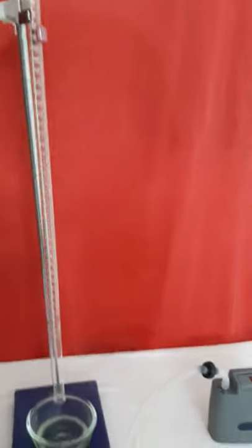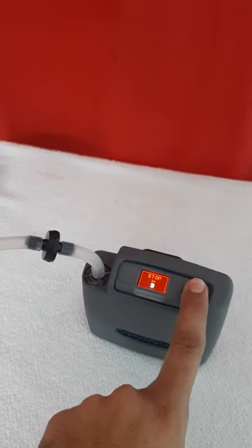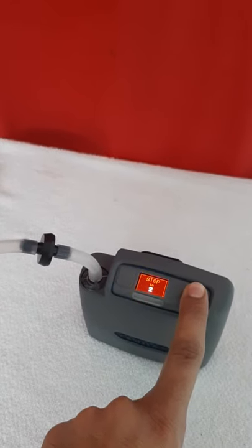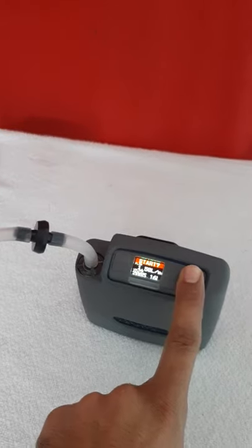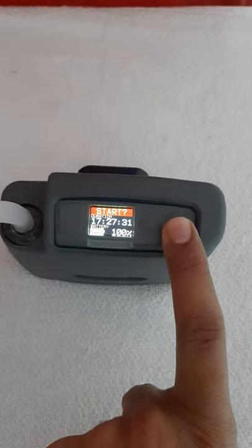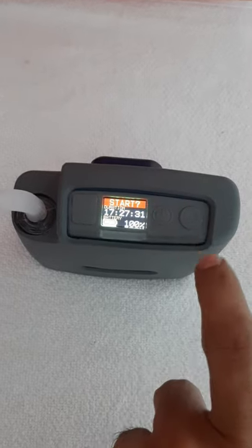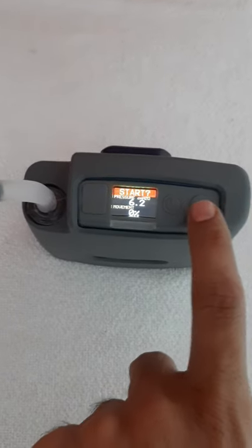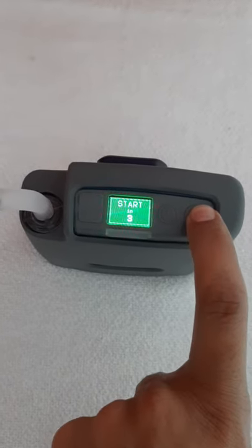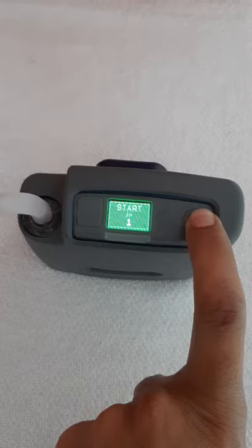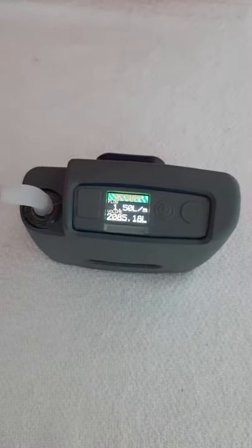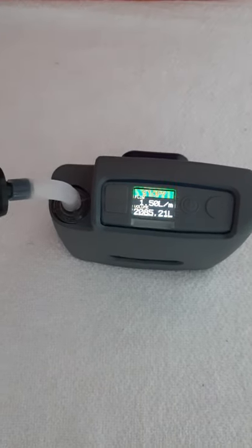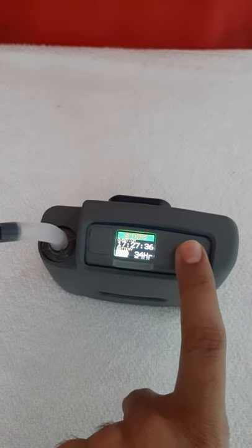First we'll see how to turn on this pump and then do the calibration. You'll find this start display. Click on this button for 3 seconds and it gets turned on. Now if you want to adjust the flow rate, stop the pump.